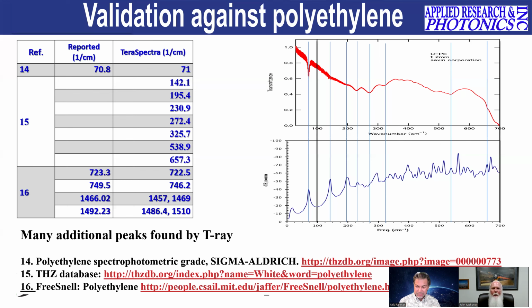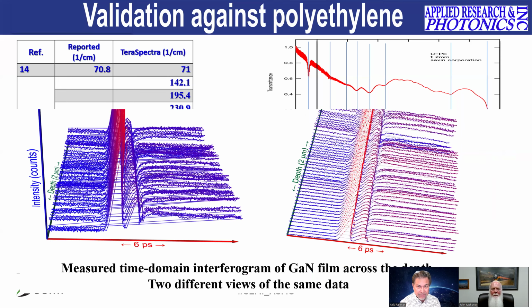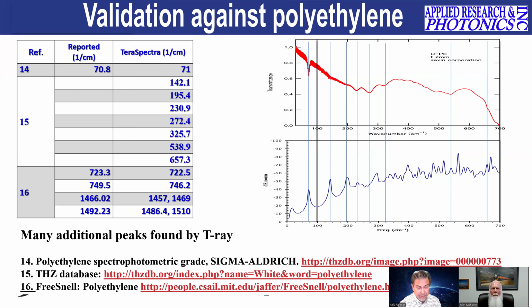Okay, very good. That's a whole other discussion. So yes, thank you so much. Please proceed. Absolutely. So let's move on. Basically we claim, and we have demonstrated, that the spectrometer checks out with the existing knowledge, but it also produces additional peaks that can be interpreted.